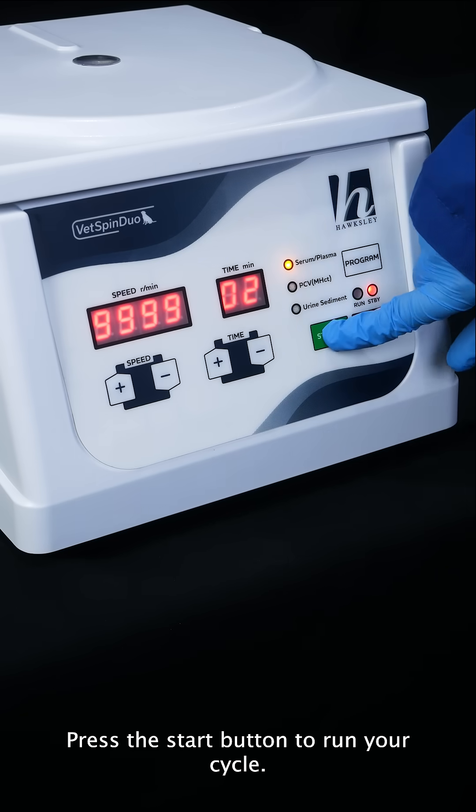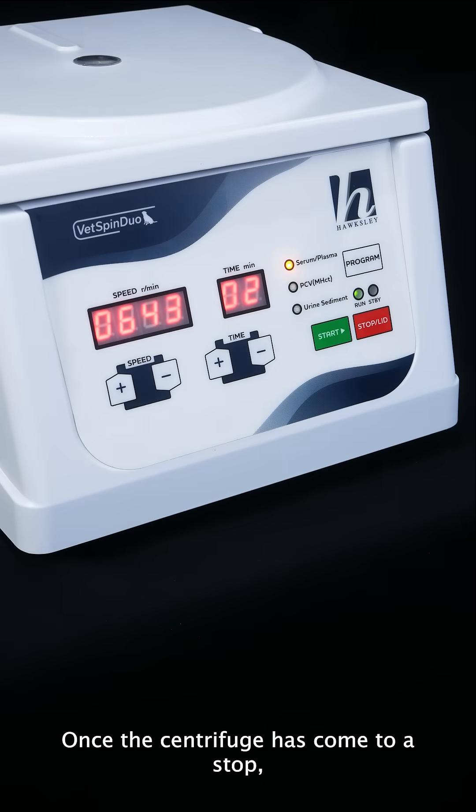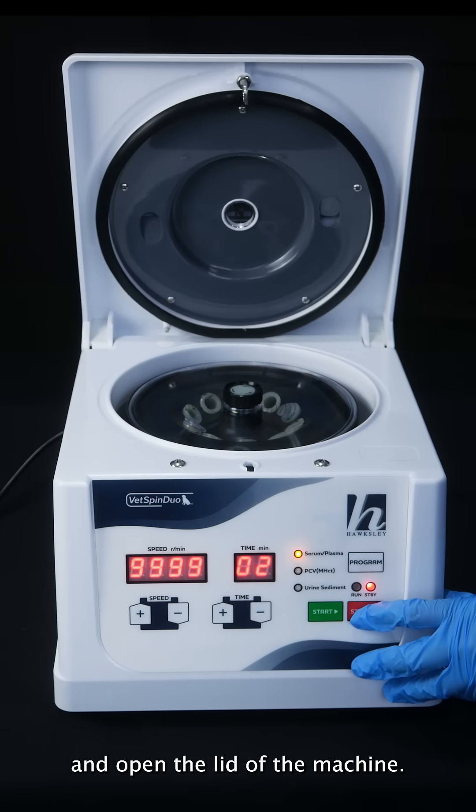Press the start button to run your cycle. Once the centrifuge has come to a stop, use the stop/lid button to end the cycle and open the lid of the machine.